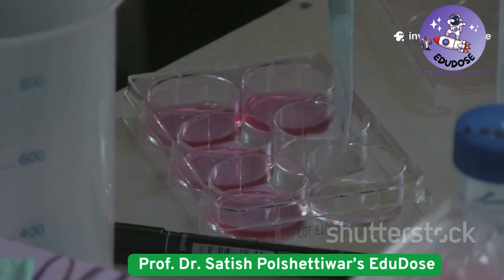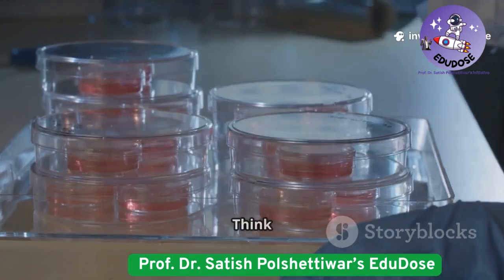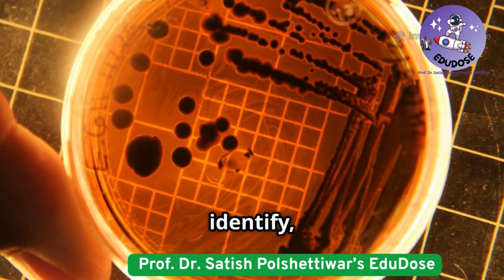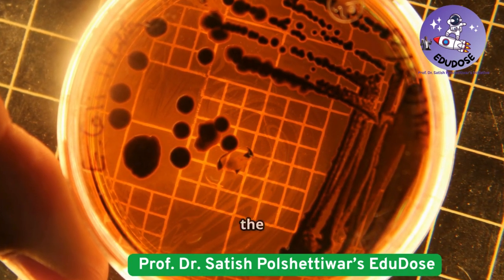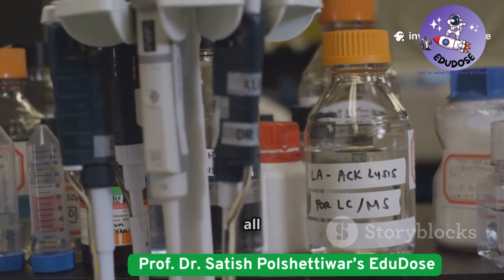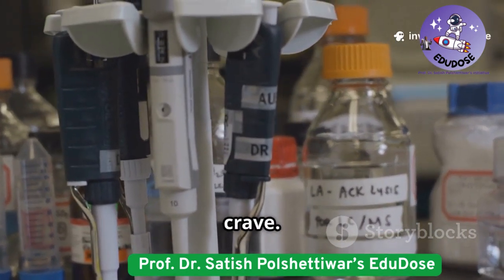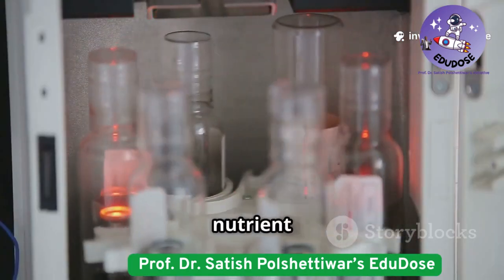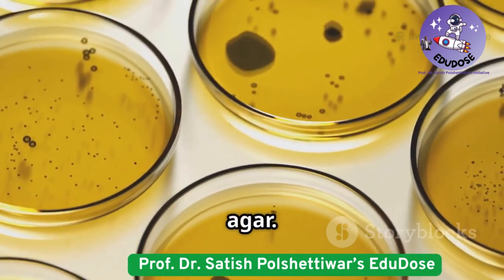Let's start simple. What is culture media? Think of it as a nutrient-rich substance that helps us grow, isolate, identify, and study microorganisms in the lab. It supplies carbon, nitrogen, vitamins, and all those essential ions microbes crave. Culture media comes in two main forms: liquid like nutrient broth and solid like nutrient agar.